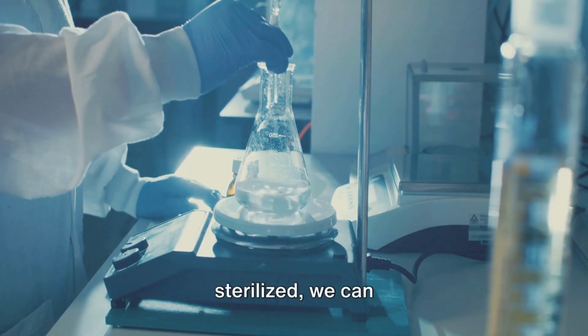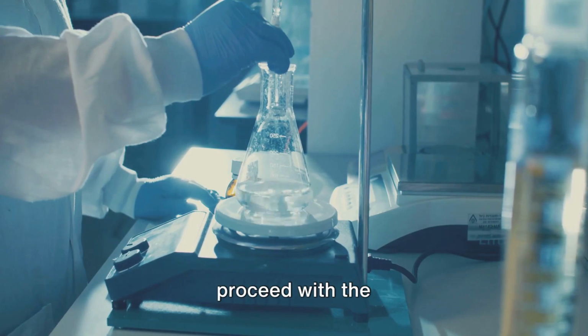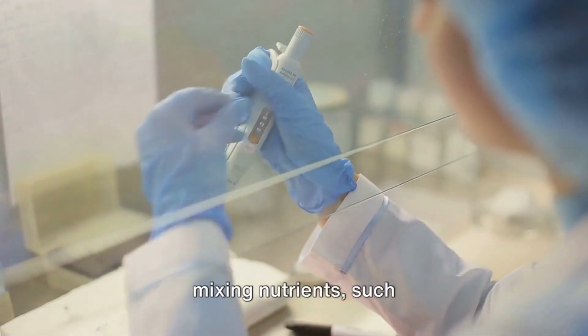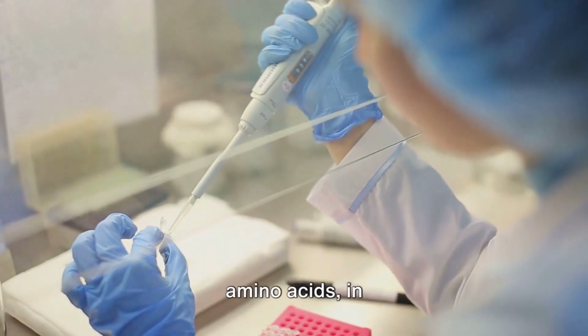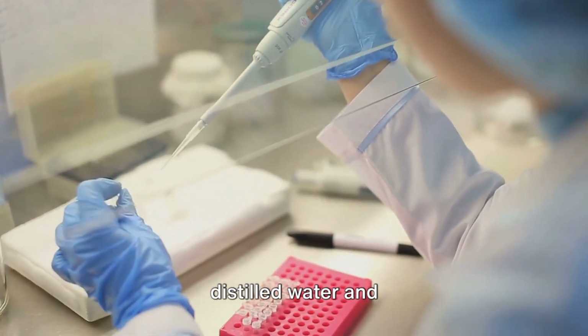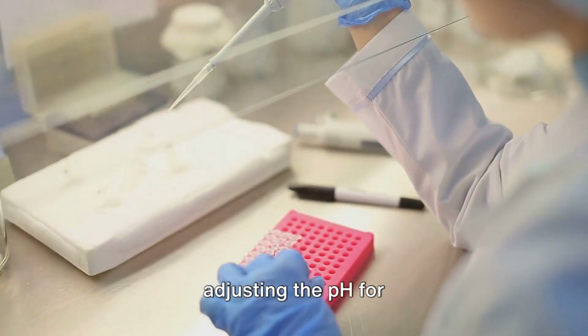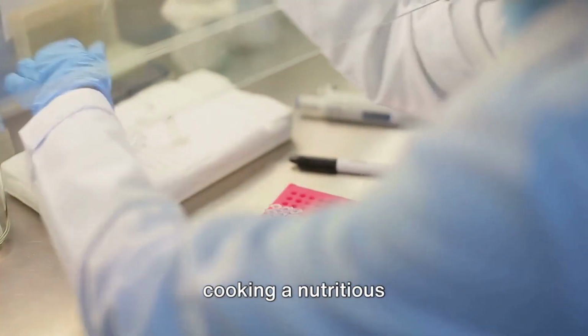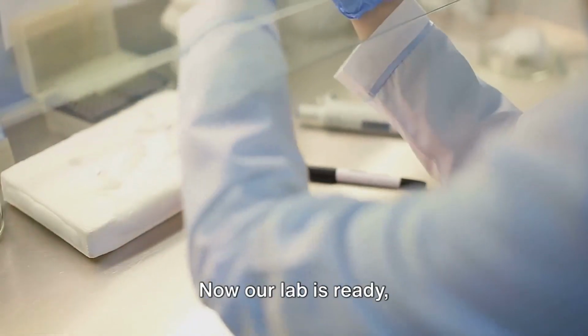Once everything is sterilized, we can proceed with the preparation of media and reagents. This process involves mixing nutrients, such as sugars, salts, and amino acids, in distilled water, and adjusting the pH for optimal bacterial growth. It's a bit like cooking a nutritious meal for bacteria. Now our lab is ready.